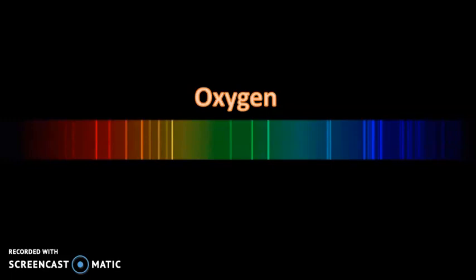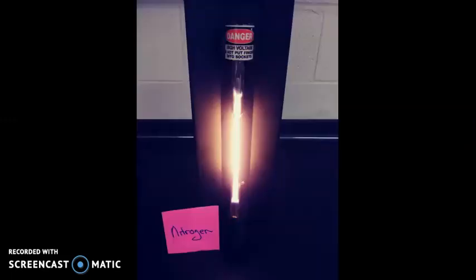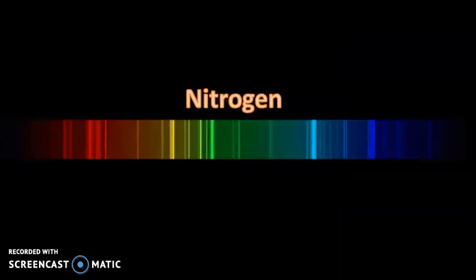Now, oxygen is way smaller than, say, like xenon or krypton. And take a look at how that affected the number of bands of color. Now, even more interesting, here is nitrogen, ridiculously bright. And when I hold the C spectra paper in front of it, I get these really beautiful bright yellow bands. And then, of course, some other colors kind of mixed in with it. Hard to interpret because of that brightness. So here's the official spectrum. Looks similar to oxygen, but I think that the colors are more dispersed between red, orange, yellow, green, blue, purple.